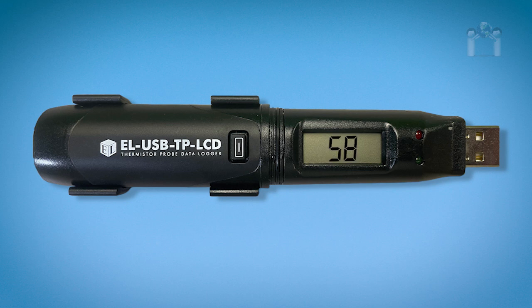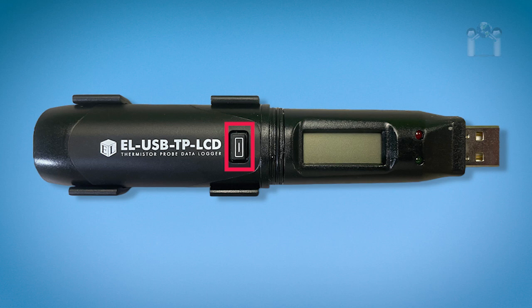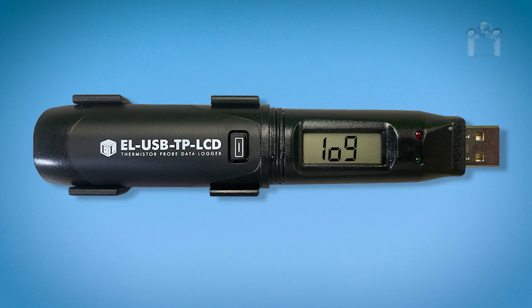After a few moments, the temperature will appear. If the logger is configured for the display to always remain on, the temperature will remain on the screen. If the button is pressed and the data logger is running in LCD off mode, only log will appear.